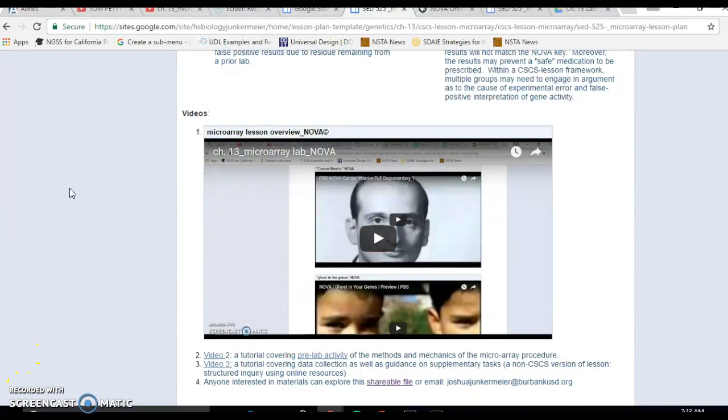So in other words, this video will take off and add a little more detail where this Chapter 13 Microarray Lab Nova version video left off. So it picks up where it left off, right? And it gives you another way of looking at the lesson using a new pH indicator or your DNA sample, using a different substance for the DNA sample.